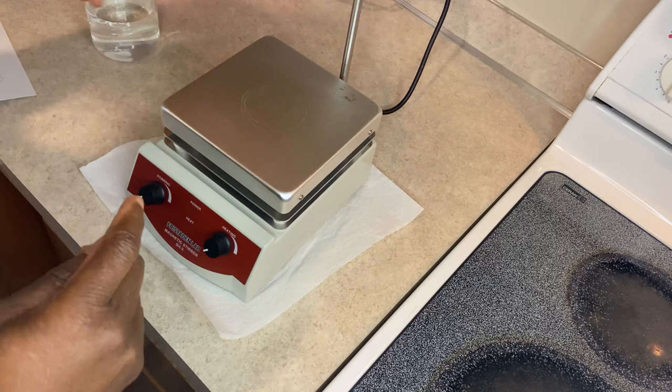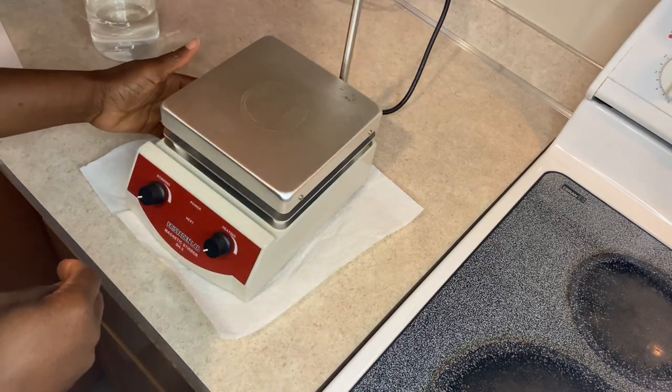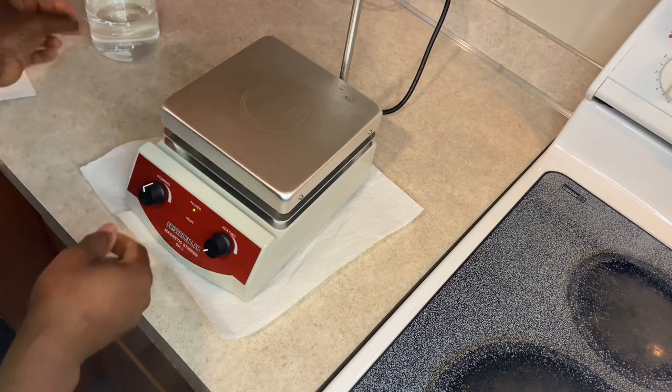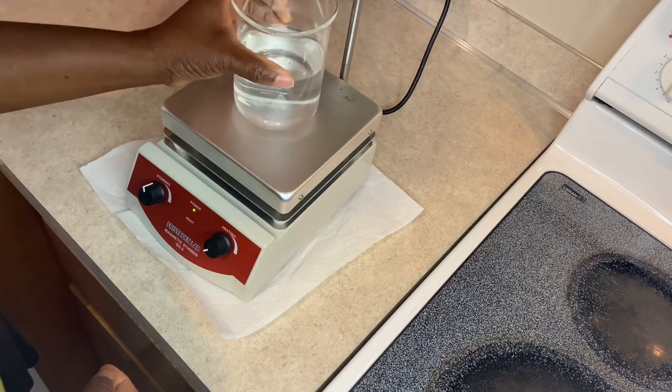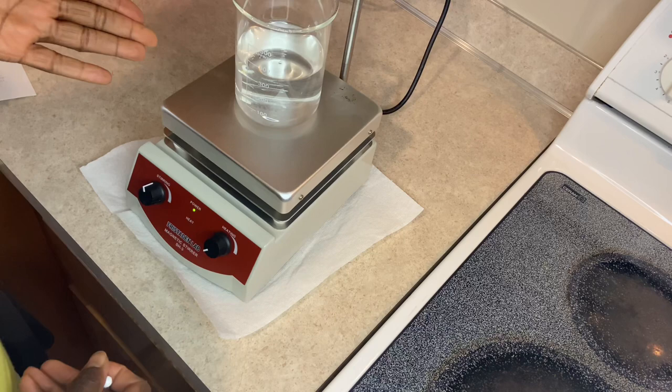So these are the steps to take. First, you plug your equipment in. There is a button on the side — you turn that button on and you turn on the stirrer. And then you can place your stuff on it.